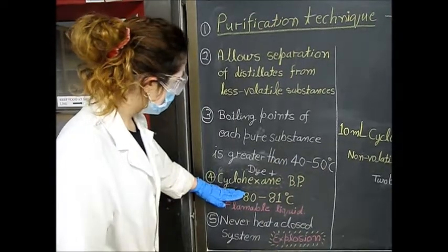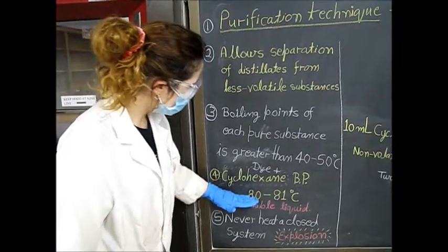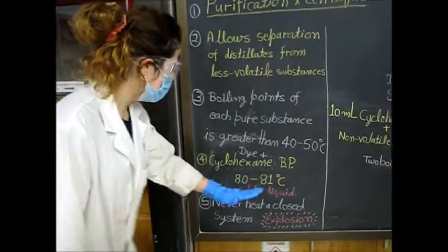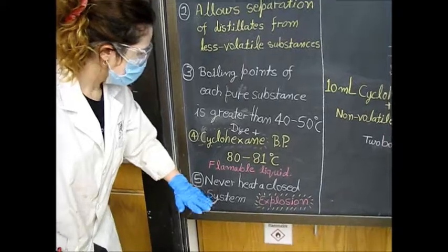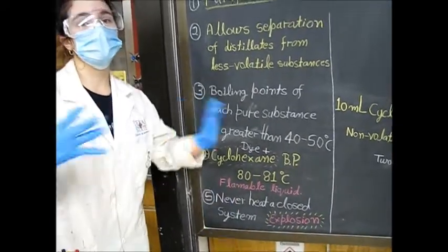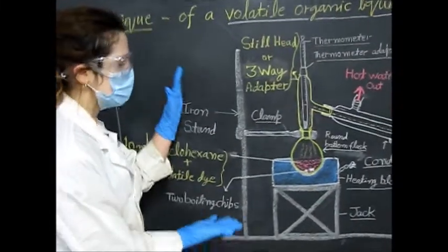For today's experiment, we're going to be using a dye plus cyclohexane, which has a boiling point of 80 to 81 degrees Celsius — this is why we can do a simple distillation. Cyclohexane is a very flammable liquid, and that's why you can never heat a closed system or it would explode. So let's look at the setup for simple distillation.